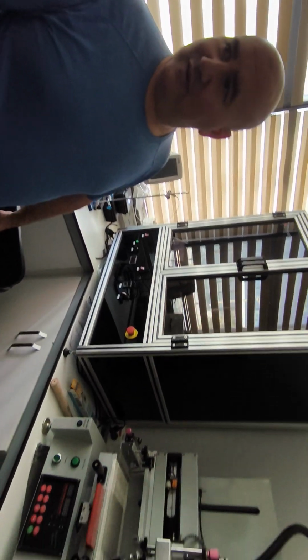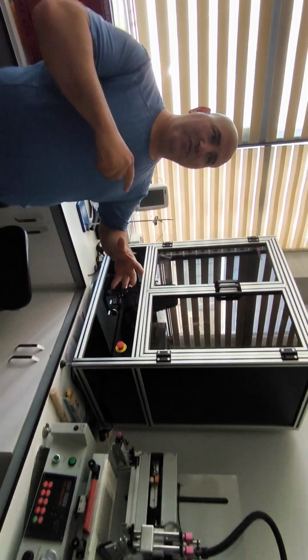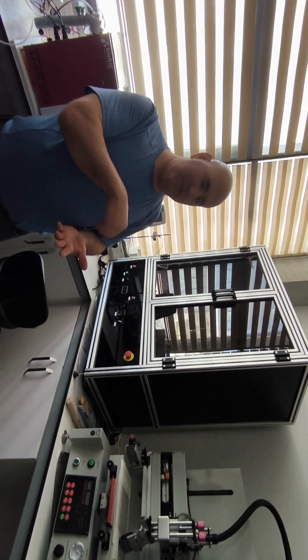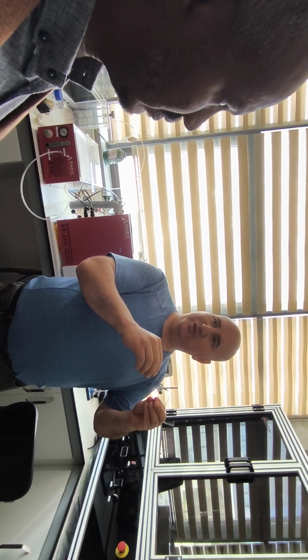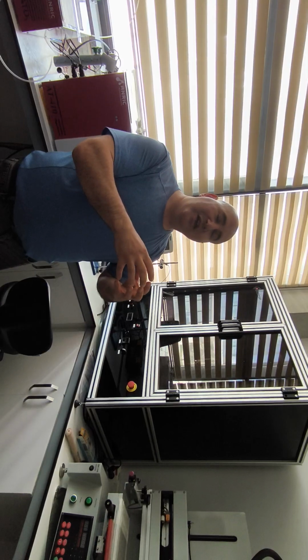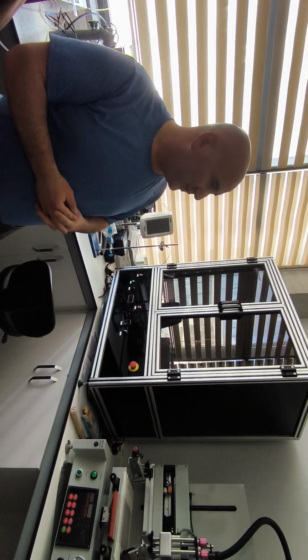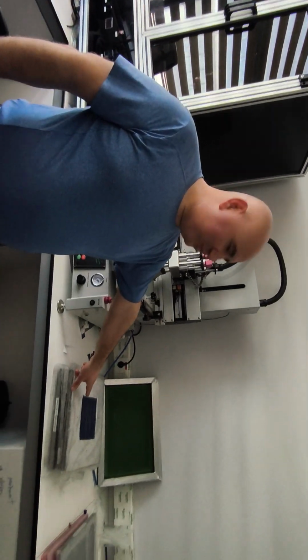This one is spray pyrolysis, if we want to make small particles, nanoparticles, with ultrasonic sonication. For example, you have a solution, and when you apply the ultrasonic part here, the solution becomes like a fume. So you have small particles, and you can keep them in water or in other solvent. This one is for when you prepare the PV solar cell.